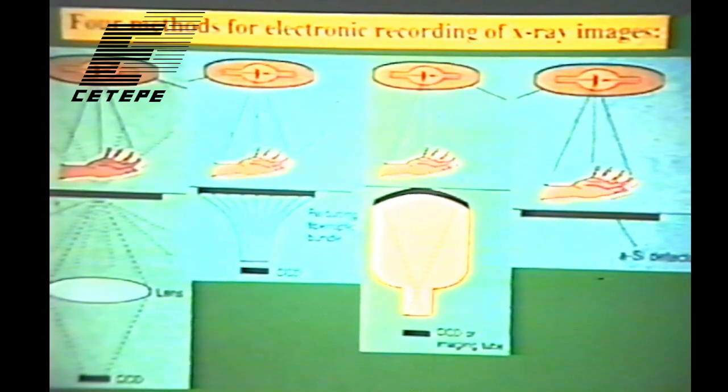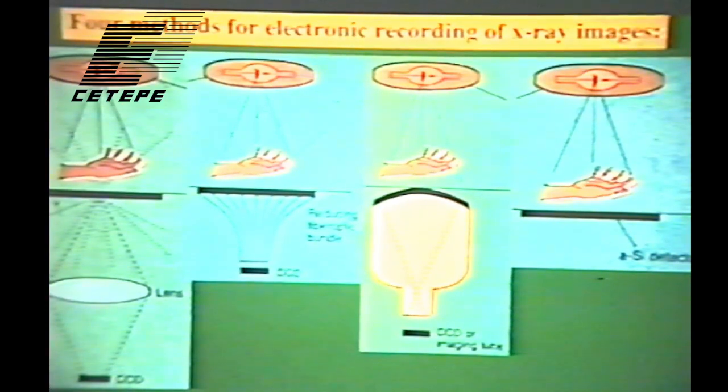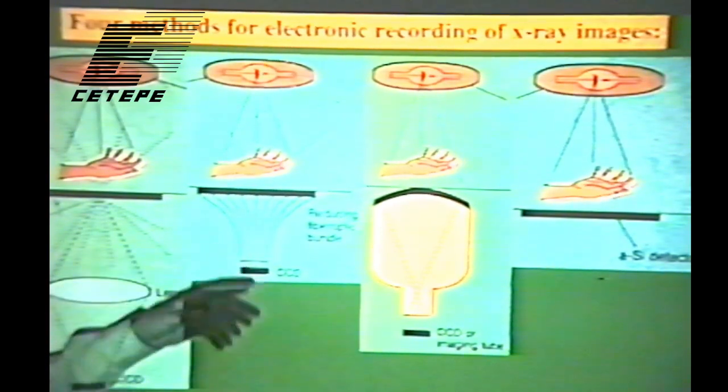That's a kind of detector that I am personally very interested in, provided you can afford the CCD. This becomes a very expensive camera because it has to have very quiet electronics and it usually has to be cooled to have noise that low. But they do exist, and so this is one way to do non-intensified X-ray imaging with a CCD, and we'll see that again in a minute.